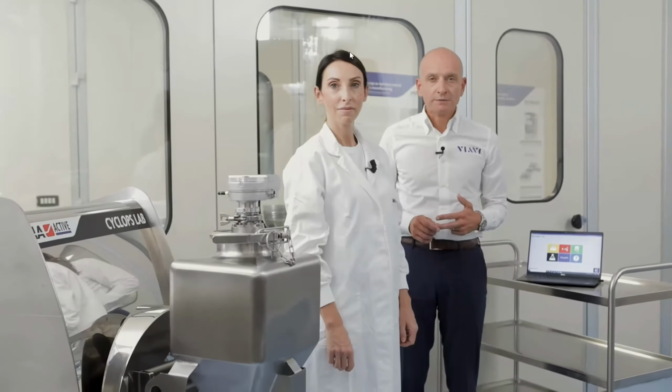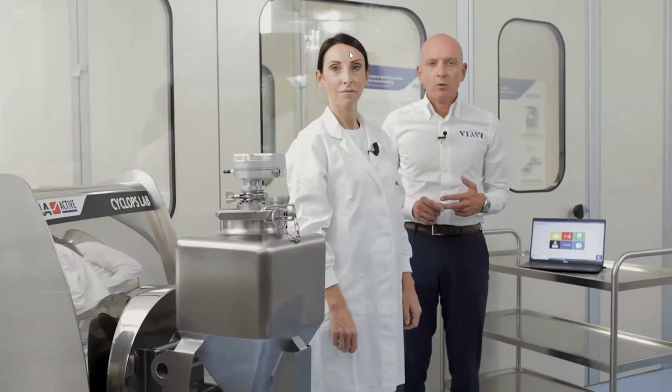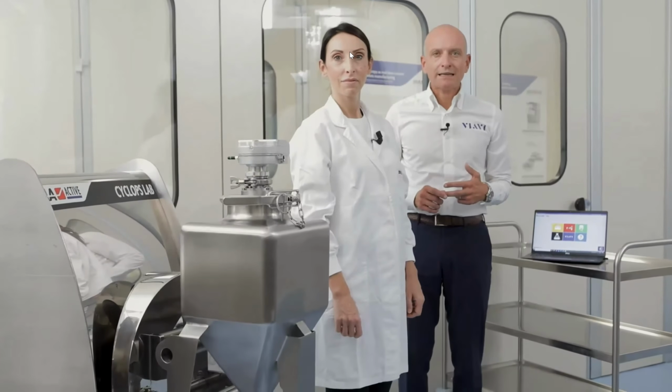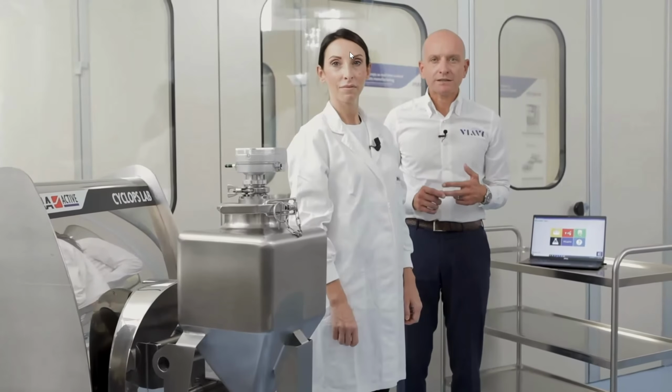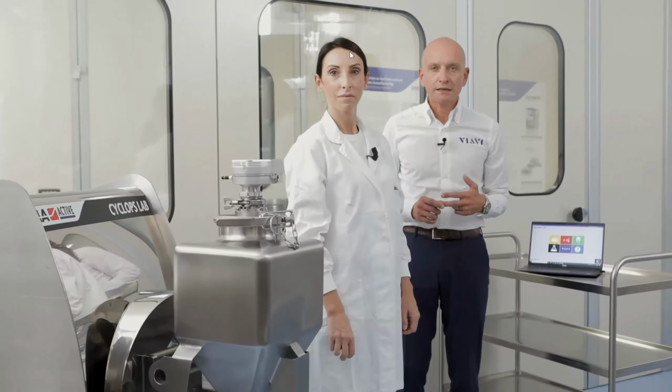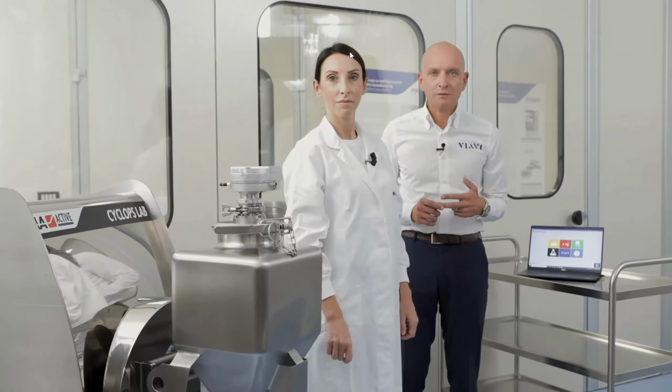The third point, probably the most important one, is that when you go inside with a sample thief, you are creating a hole, and this hole is immediately filled by the finer particle size. The consequence of this effect is that you completely destroy your blending just to make the analysis.